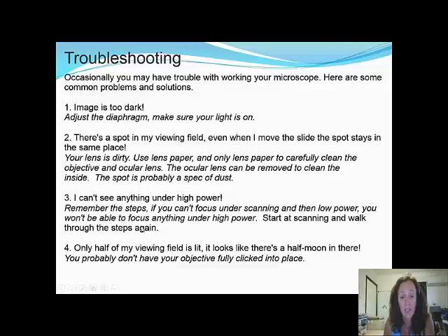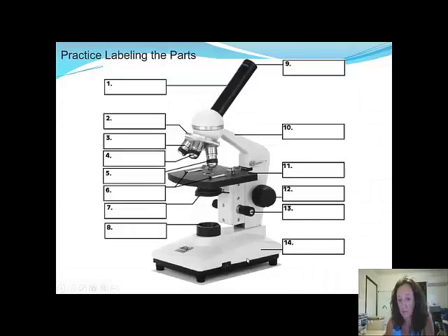If only half of your viewing field is lit — it looks like a half moon — you probably don't have your objective lens fully clicked into place. Now I want you to practice labeling: your evidence of watching this video will be a list from 1 to 14 of the parts of the microscope. We will carry out a quiz over the microscope and focusing in class. Thank you class — I look forward to seeing you in lab. Bye!